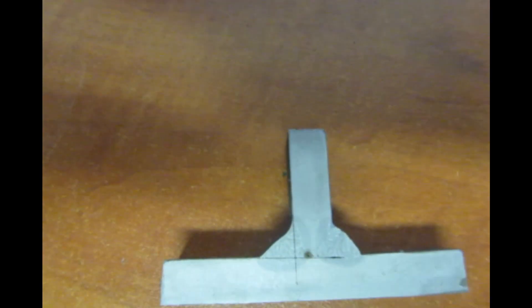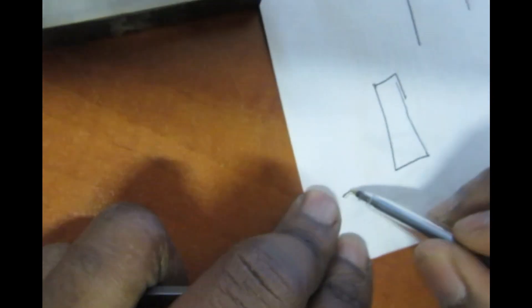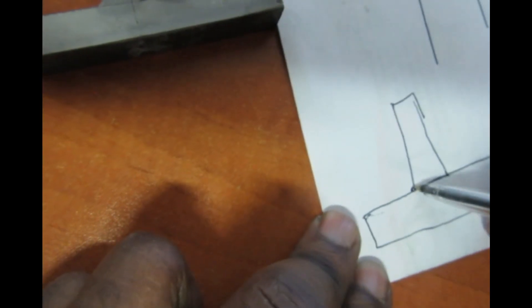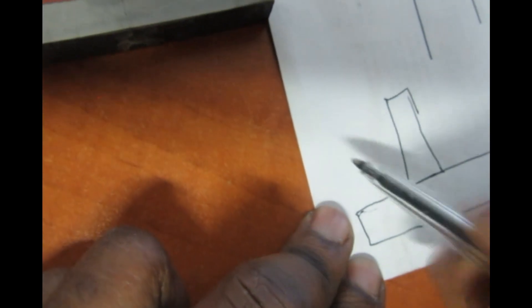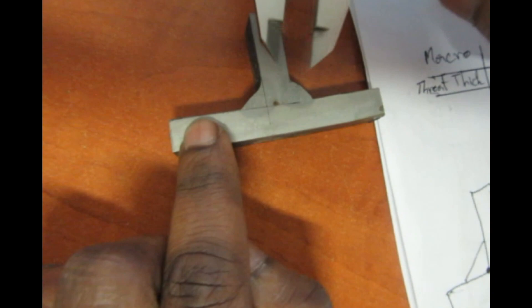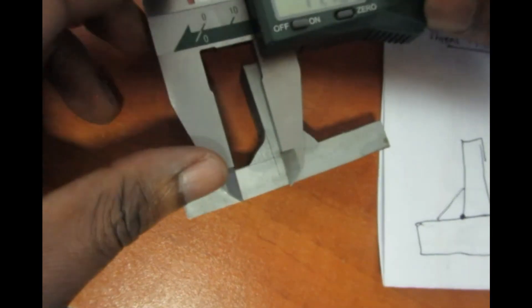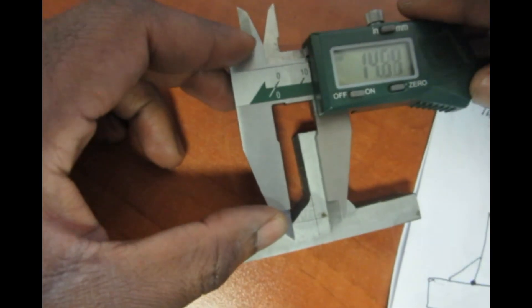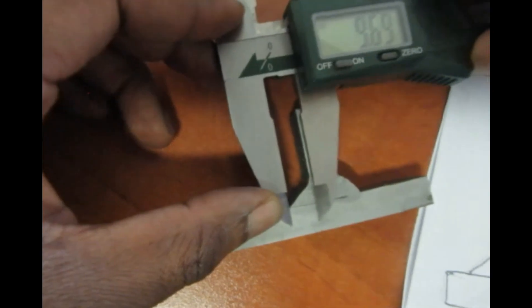Now I want to measure the leg length. For this, I need to see my roots. Let me give you a demonstration. If I draw my plate, that is my roots. I want to see fusion on the roots, penetration of the weld in the roots. I'm going to measure the horizontal length and consider it as my leg length one, from the end of the weld to where it starts with the other plate. That is my first measurement: 9.36 millimeters.